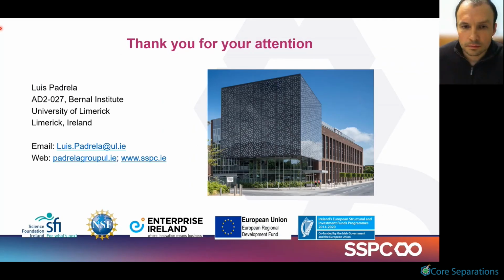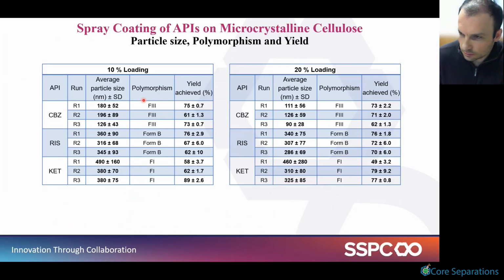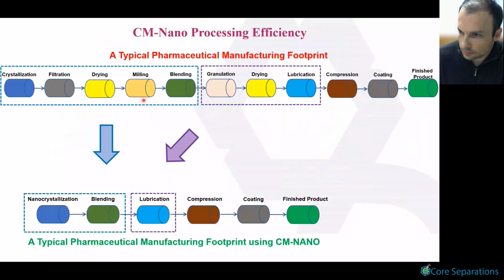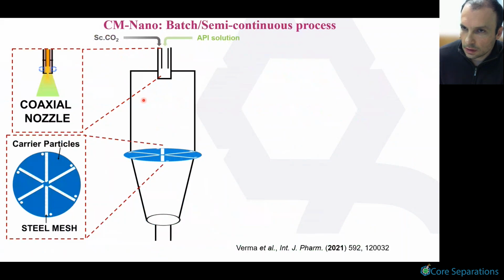Thank you for your talk. I have a small question on the solvent choice of your API. So you said you use organic solvents that have to be soluble in supercritical CO2. But you also showed some nanospray dried BSA and lysozyme, which are enzymes and proteins, which do not like those organic solvents. So how do you do nanospray drying of those particles or those proteins?